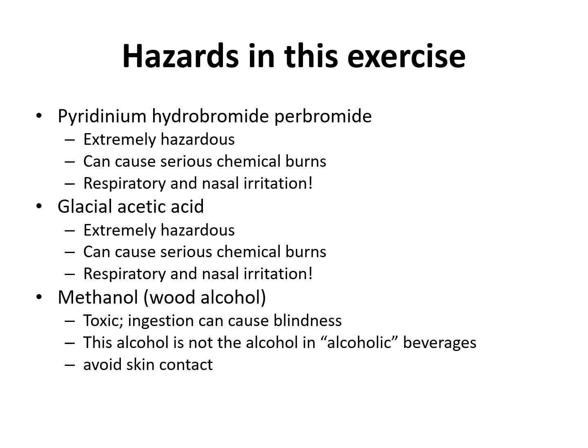But methanol is a little bit different from the other alcohols, as it is toxic, especially when it is ingested, and it can also cause blindness. So take care in handling methanol, but not only ingestion, you should also be very careful to not have this solvent come in contact with your skin.